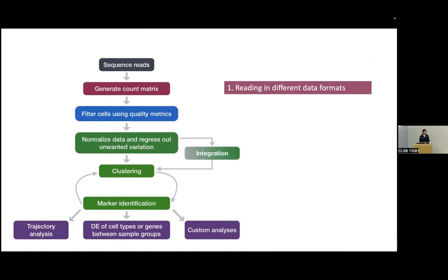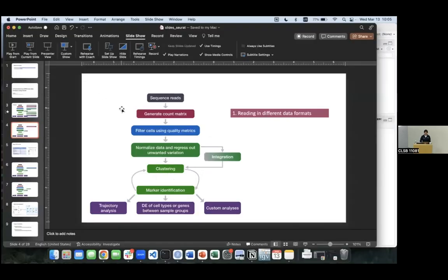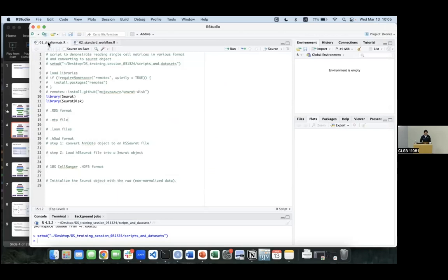So, okay, we can begin. If everyone has downloaded their data sets, we can move on to the first one. So 01 data formats.R provided on GitHub. Can people show thumbs up if you can download the data sets before we proceed? Okay, I've seen one thumbs, two. Okay, that's good. Thank you for responding.